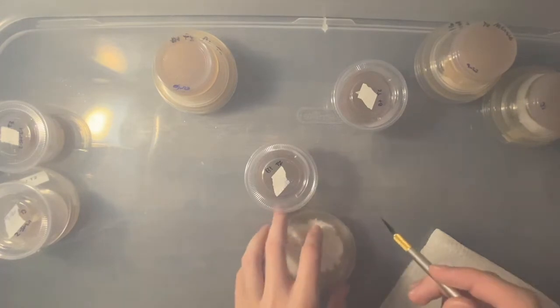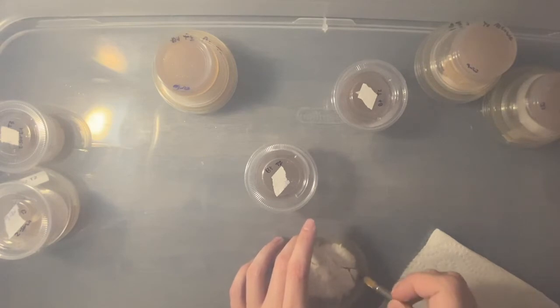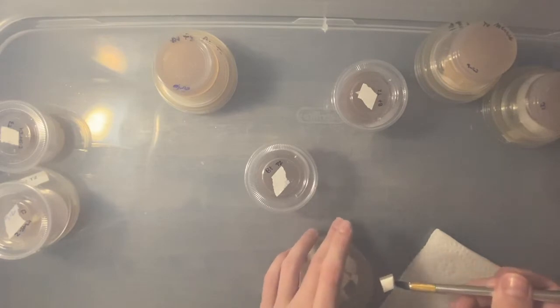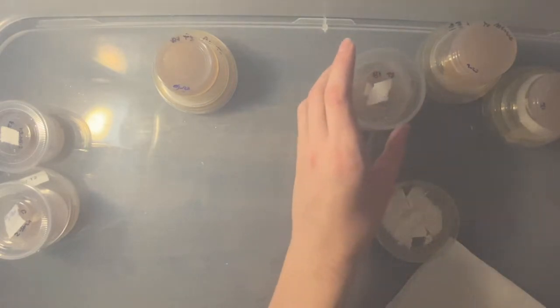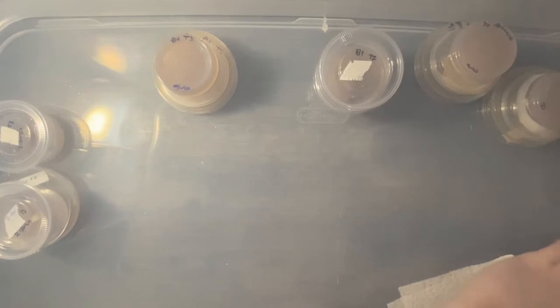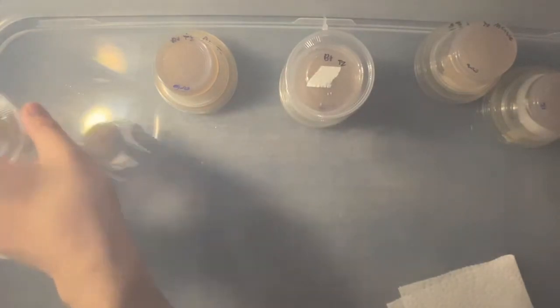That piece is alright. I would actually prefer this. Damn, why is that knife just ripping the mycelium up? That sucks. Alright, I'm going to take this piece. I prefer putting my pieces mycelium face down just because growth starts a lot quicker, but it's all the same. I'm gonna move that out of the way, and this is the one that you guys missed.